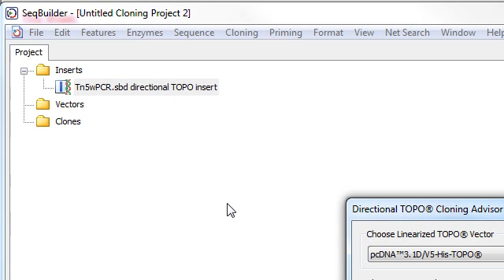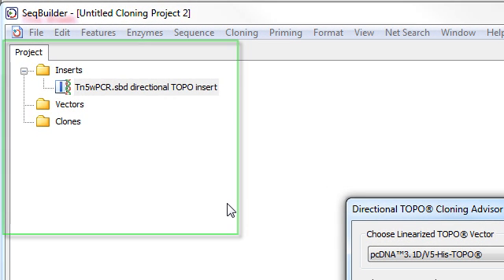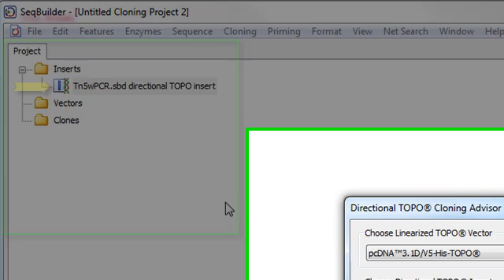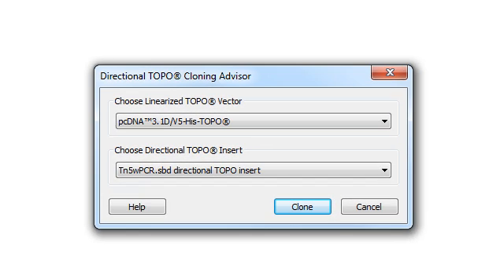And as you can see, a new cloning project has automatically been created for us. The new directional TOPO insert is displayed here within the Inserts folder, and the Directional TOPO Cloning Advisor dialog is displayed.